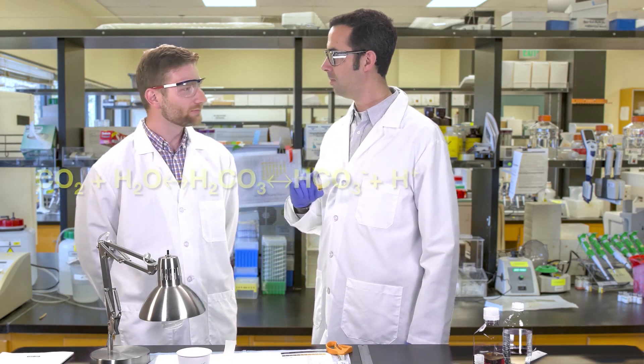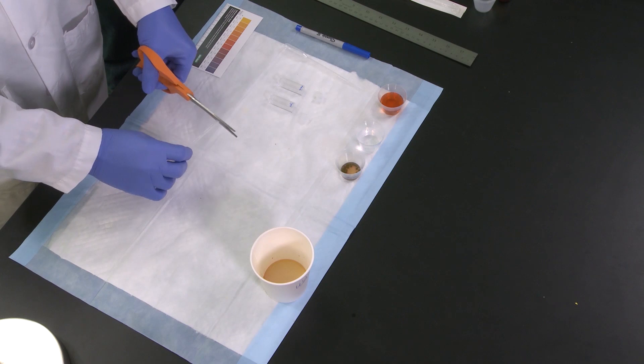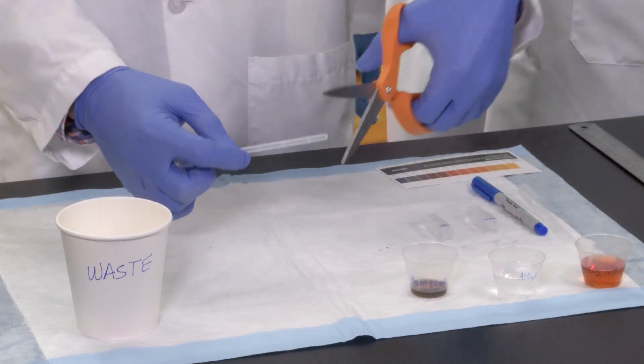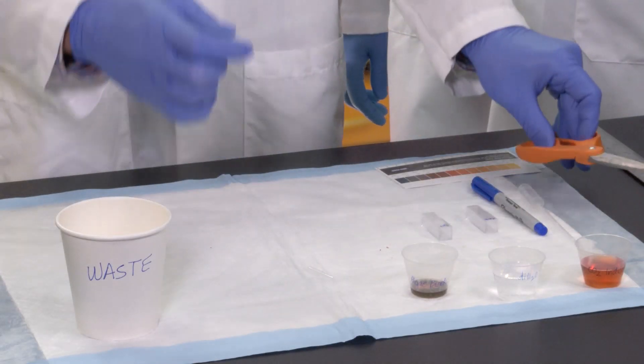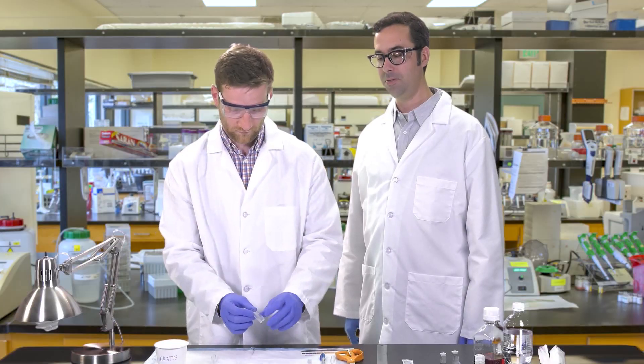You will need to transfer 10 algae beads into each cuvette. You can do this by cutting the tip of a disposable pipette at the 100 microliter mark, then cutting it at a diagonal to make a scoop. Don't forget to label your cuvettes.